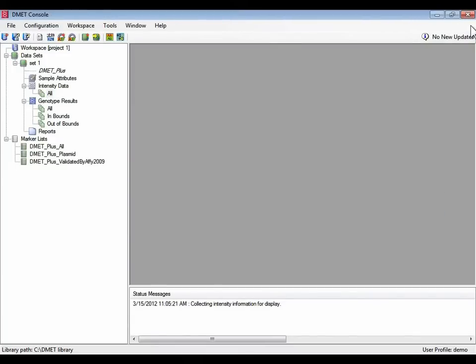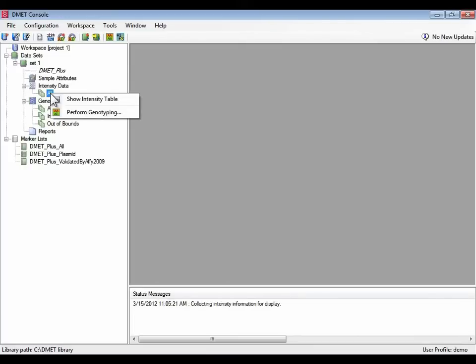Another way of accessing it is by just control clicking on the intensity data all group and perform genotyping. Again, this does the same as selecting all the rows in the table and saying perform genotyping.